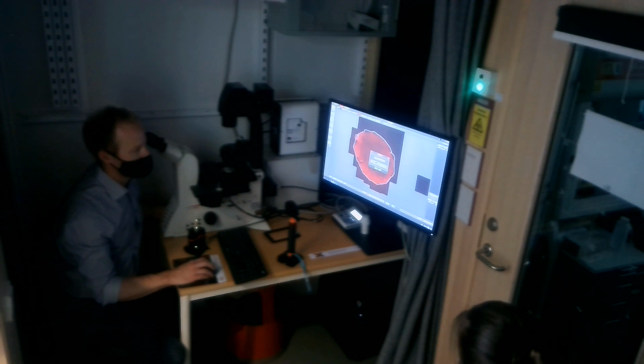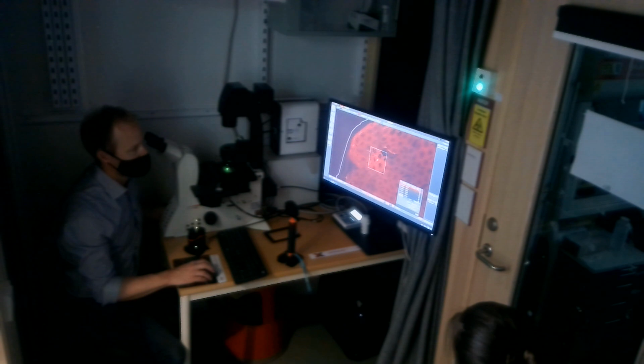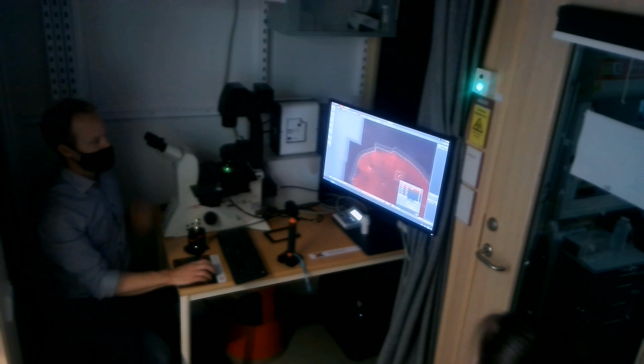So you have the current region or all regions. I'm gonna go with this region, 6 of them, and I will place them a little bit randomly, and then I can continue to create my focus map. Go to the first position, go live. I can put this one more or less in focus. I have a position to start with, and then set this and find the remaining with the autofocus, for example. And now we'll go.